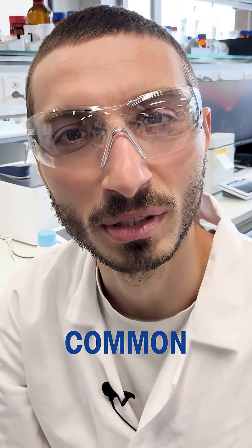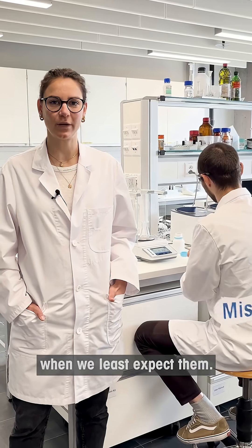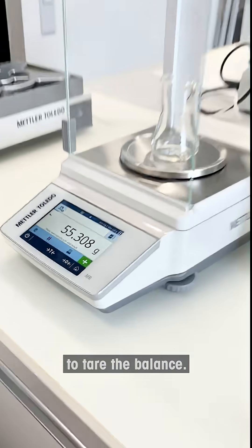Do you know what the most common mistakes are when weighing samples in the lab? Mistakes can sneak in when we least expect them. Like right now, when you forget to tare the balance.